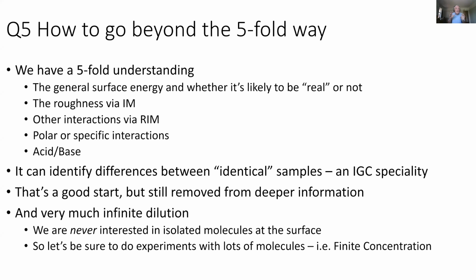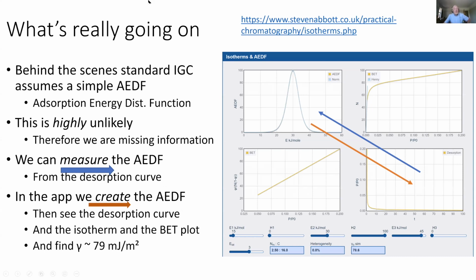So it's nice staying in the safe world of infinite dilution, as Julien did, but there's more to life than infinite dilution. See, we are never interested in isolated molecules at the surface, or most of us aren't. So let's do experiments with lots of molecules, i.e. finite concentration. So this is when we find what's really going on.